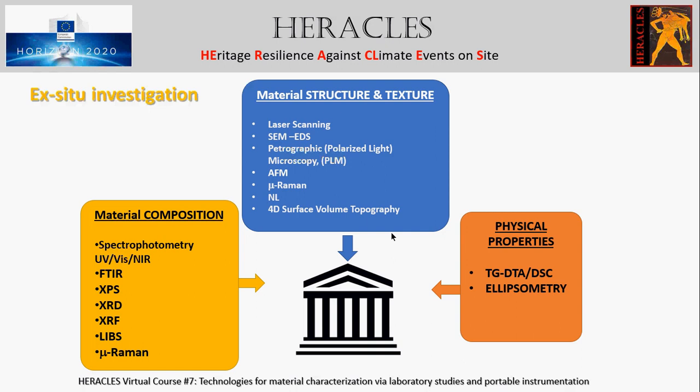Consequently, it is effective for characterizing patinas, incrustations, efflorescences, and related phenomena. As a surface analysis technique, it is crucial in the evaluation of remediation treatment of the surface. For this technique, the sample recuperation is possible.